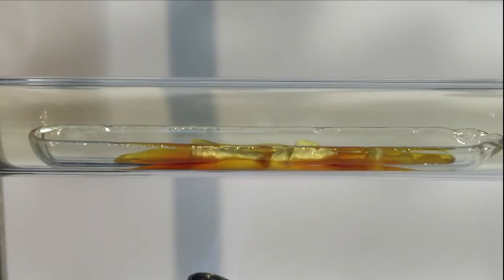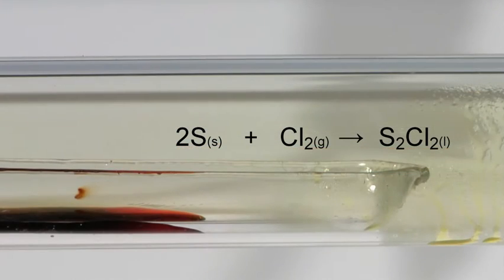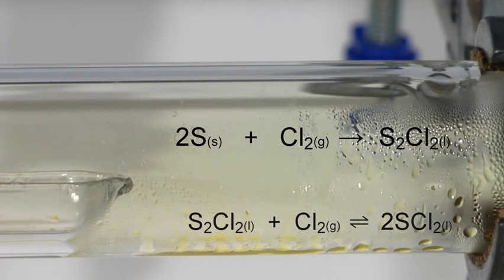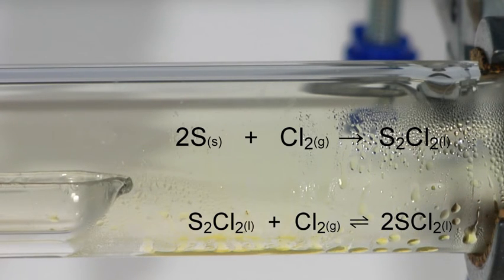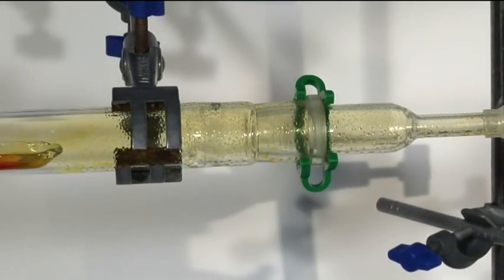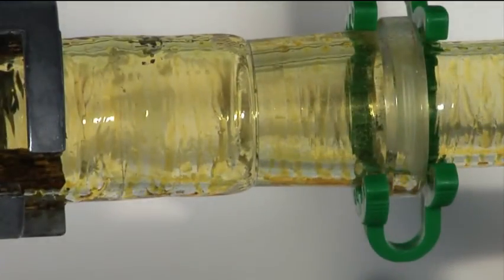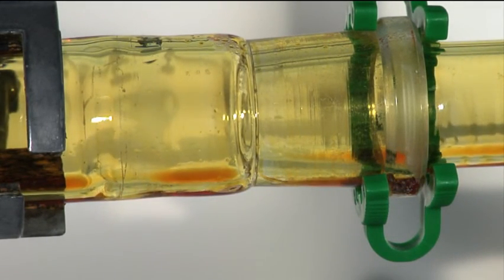The major product of the reaction is disulfur dichloride. Some sulfur dichloride will also form in an excess of chlorine, but this compound is fairly unstable and will disproportionate to disulfur dichloride. Pure disulfur dichloride is a pale yellow compound, and sulfur dichloride is dark red.